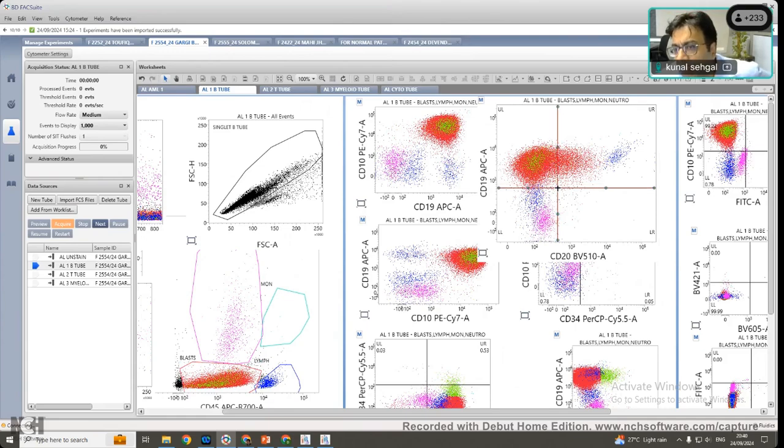So this is important, what sir asked, because on IHC we do not have CD19. You will do blasts which are CD34 negative. You will say CD20 negative, CD34 negative, CD3 negative, MPO negative. I don't know what this is. But if you put markers like TdT, they can be positive in blast, most common in ALL blasts like T and B. You should use CD10.